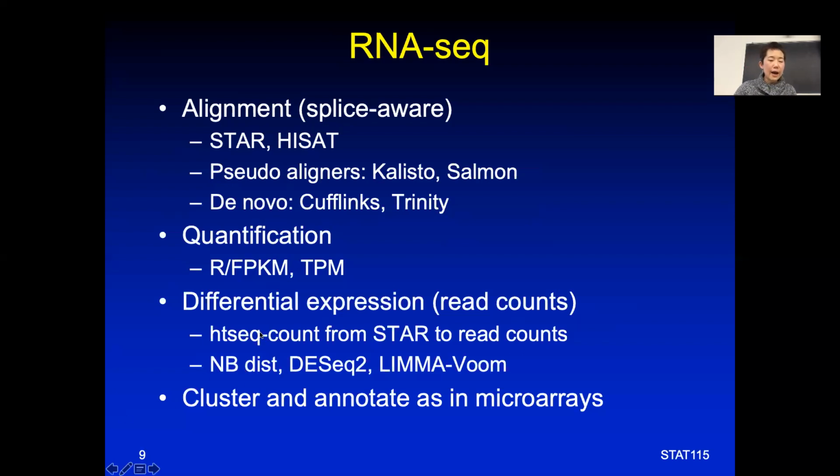Okay, and then for differential expression of the RNA-seq, we learned that RNA-seq read coverage on the genes follows a negative binomial distribution, and algorithms like DESeq2 use it. And I want to also quickly mention there's Limma-Voom. This is the group that developed Limma. If you have an experiment with very complicated designs, like you knock down genes with different siRNA, and you do different replicates, a really complicated factorial type of design, Limma-Voom is probably better. But if you just have simple, most of the time, 2 conditions, you want to do differential expression with very few replicates, DESeq is much more sensitive.